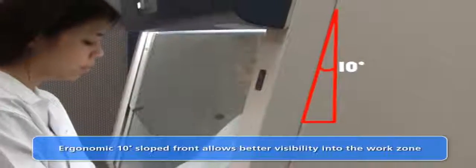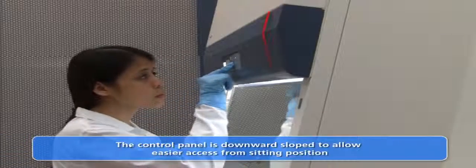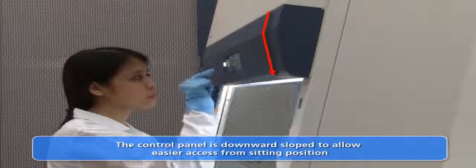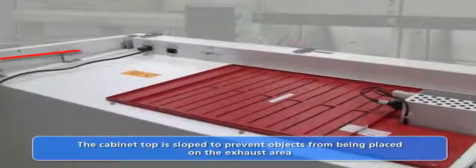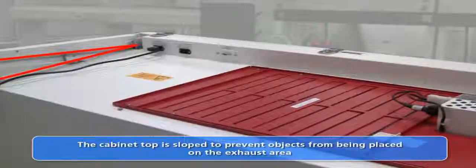The cabinet is designed with a 10-degree sloped front which provides better visibility into the work zone. The microprocessor control panel is downward sloped for easier access to the control buttons from a sitting position. The cabinet exhaust filter area is also designed with a slope to prevent loose objects from obstructing the exhaust airflow.